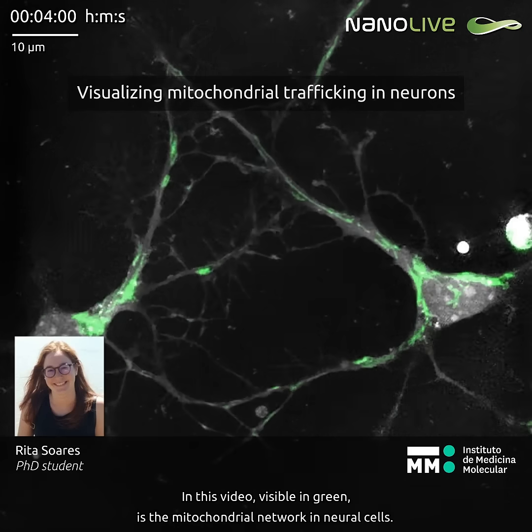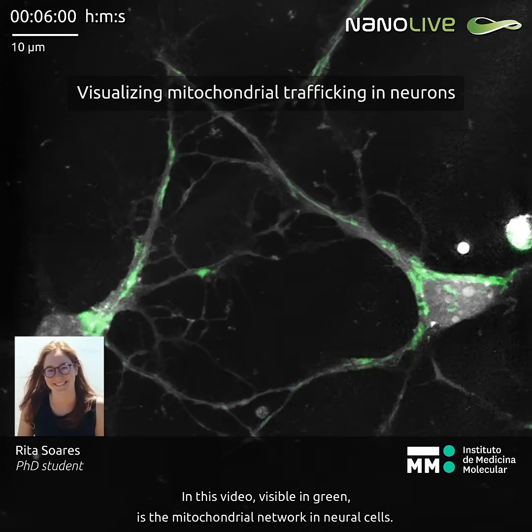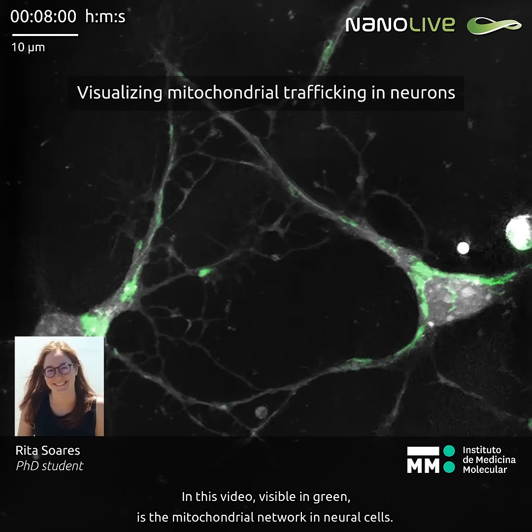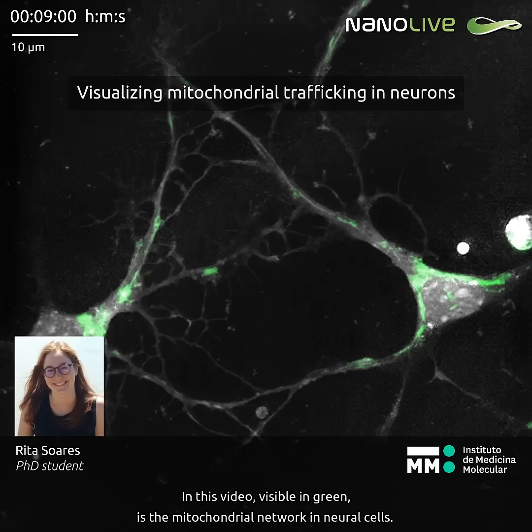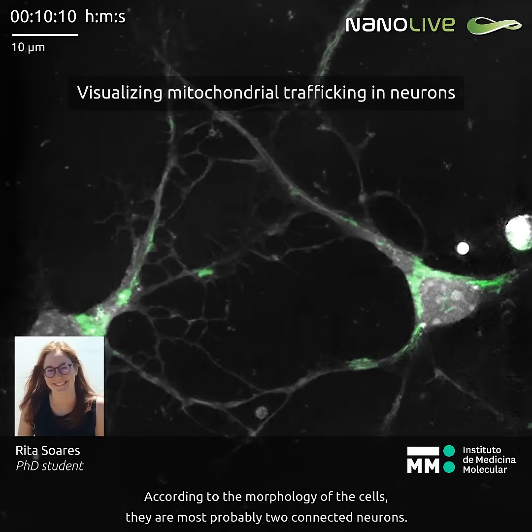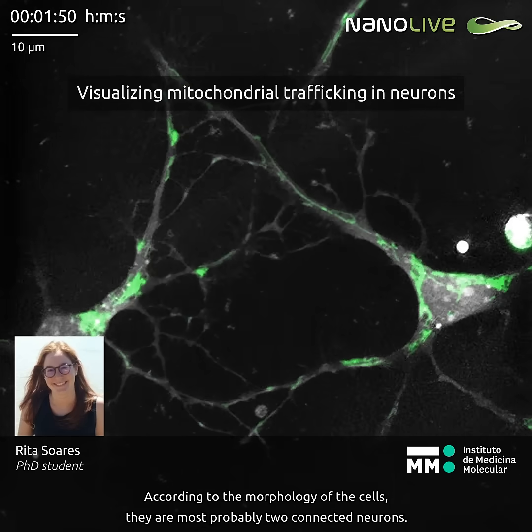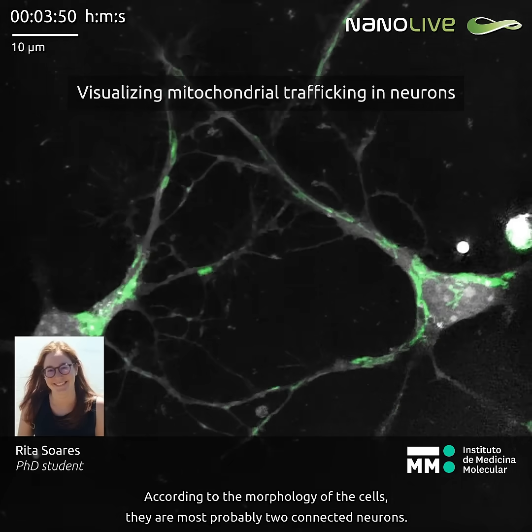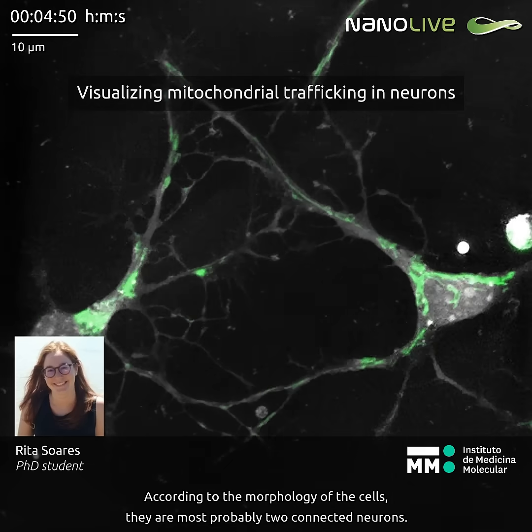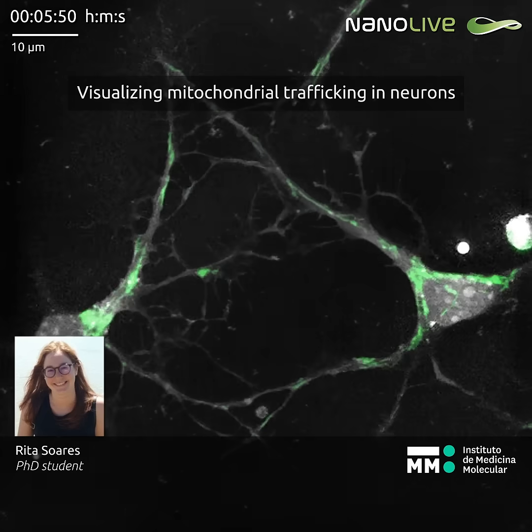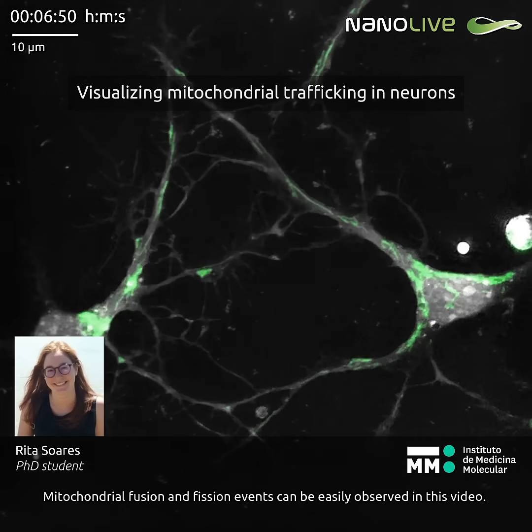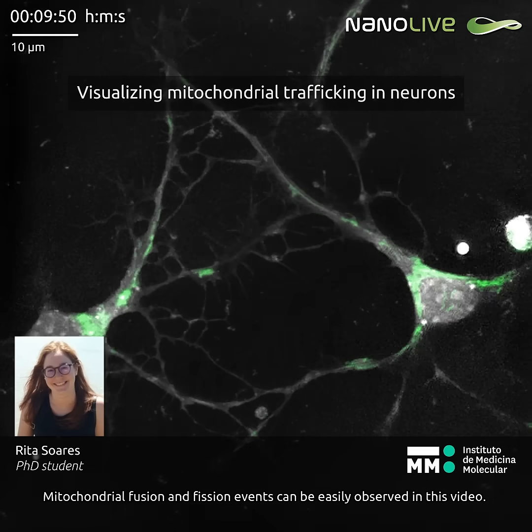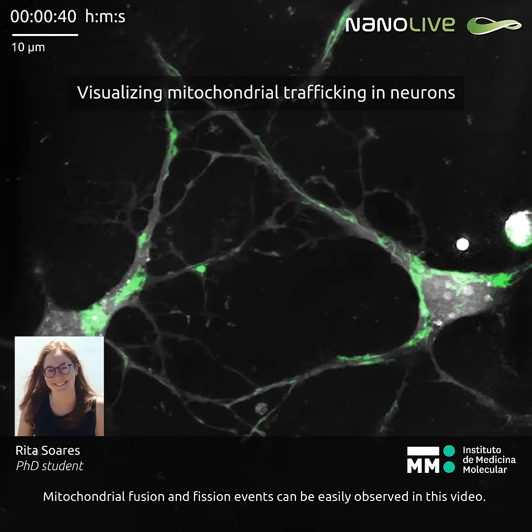In this video, it is visible in green the mitochondrial network in neural cells. Accordingly with the morphology of the cells, they are most probably two connected neurons. Mitochondrial fusion and fission events can be easily observed in this video.